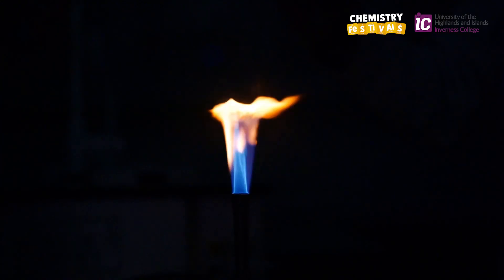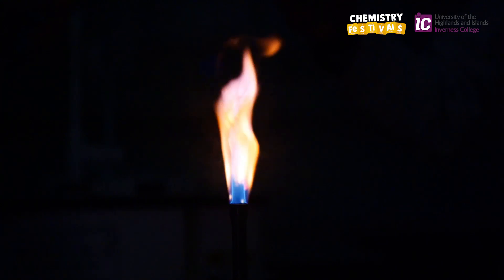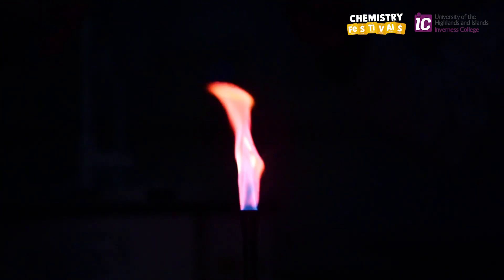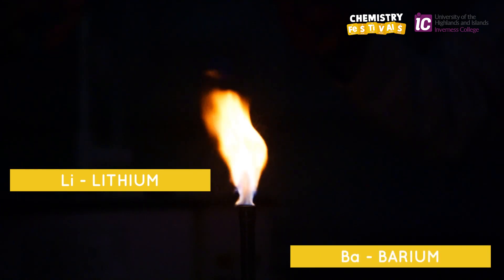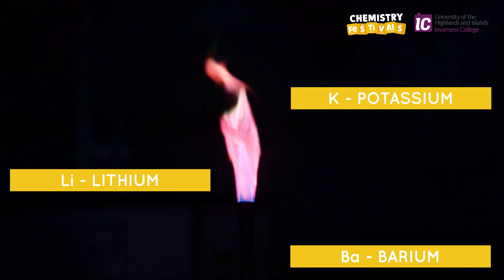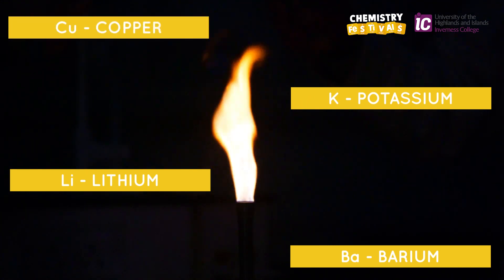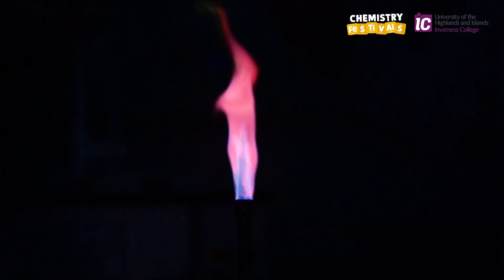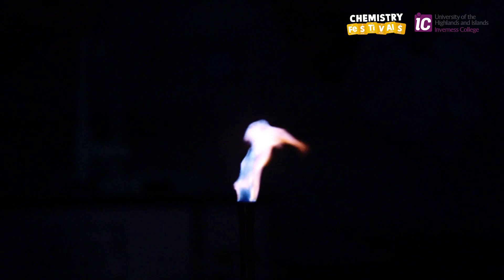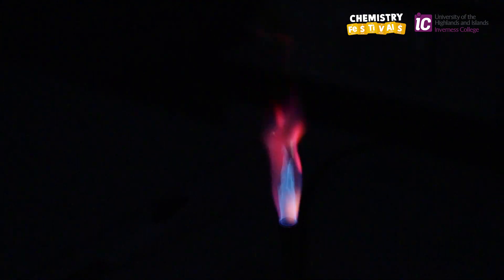We're now going to get somebody to assist me so that we can spray four metals into the flame in sequence. We're going to use metal A, lithium, metal E, barium, metal C, potassium, and metal B, copper. Watch how the flame changes colour, and also see how the flame wobbles as the spray of metal solution enters the flame. This is a particularly enjoyable experiment. The colours are beautiful, and if we observe the flame changing colour and moving in slow motion, it looks like the flame is dancing.